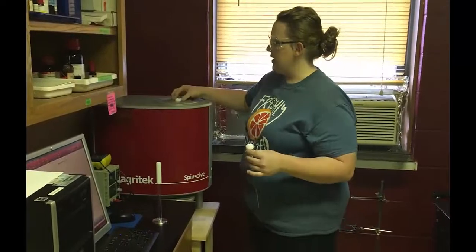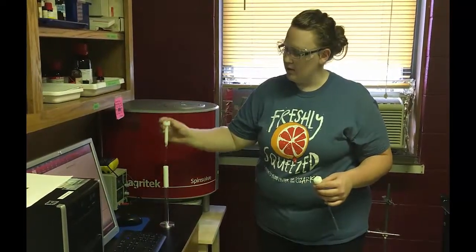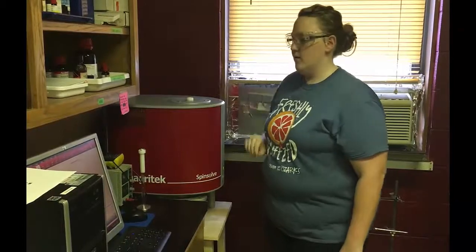So pull this out, and this here is the standard. This always lives inside the machine, and you'll only take it out to put your sample in. So you slide your sample in straight through the top and let it slide all the way down. Then you come over here to the computer.